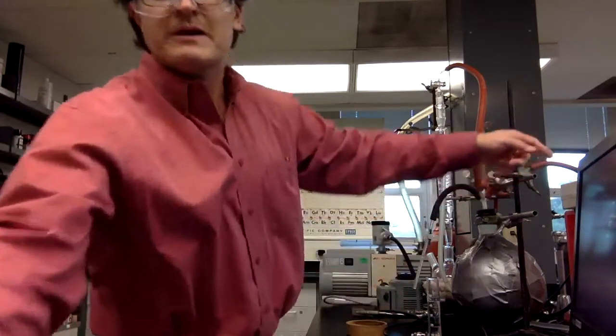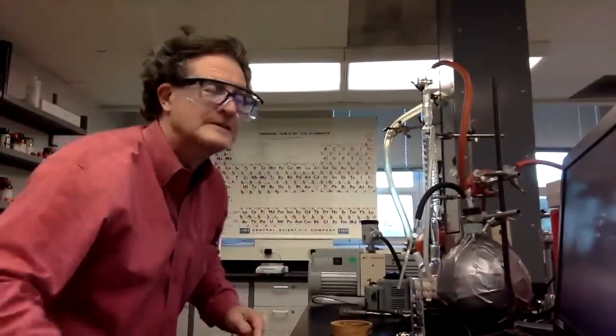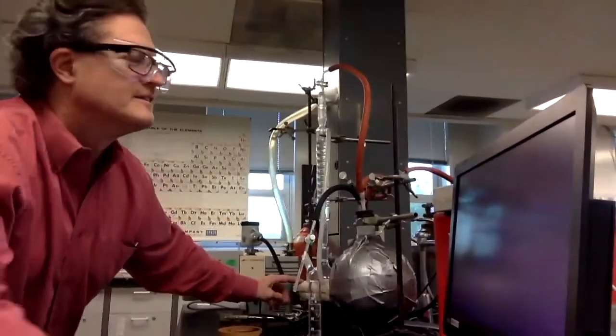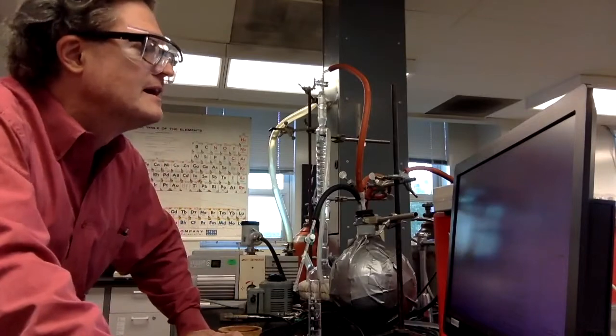The MicroLab box is up. There's Mr. MicroLab box. We're going to use that today to measure temperature and pressure, and also time, though we don't need to record that, actually. Heating mantle, we've got a heating mantle down here. The variac back here, so we can control the power into the heating mantle.